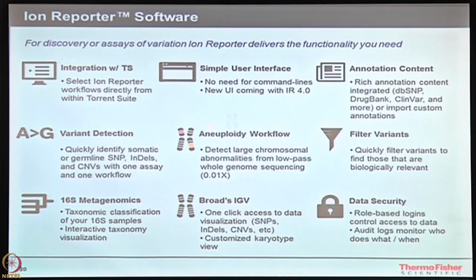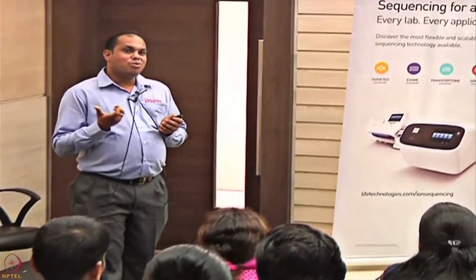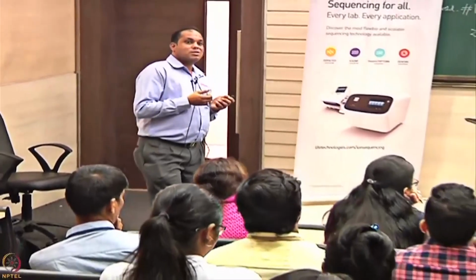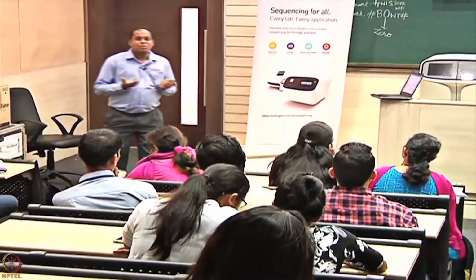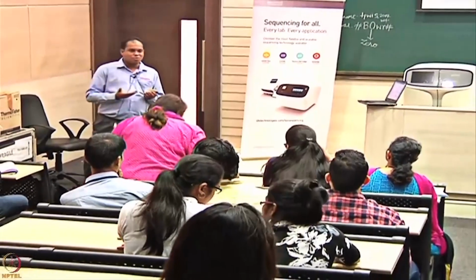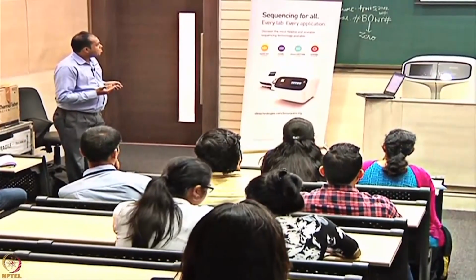As well as you have something called aneuploidy. So you would like to look into large deletions, or look for aneuploidies across your embryos, right? You must have heard about IVF, right? So in IVF, they normally go forward with certain embryo screening, where they like to know whether there are deletions or duplications happening in your data or not. At that moment, this particular workflow would be very helpful for you. Okay. So not touching much on this, rather the other part of it.